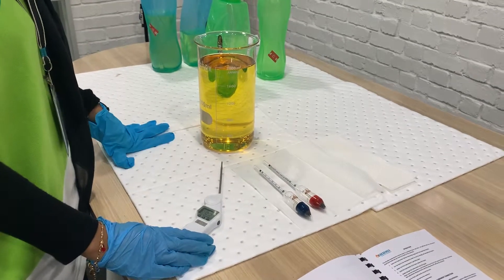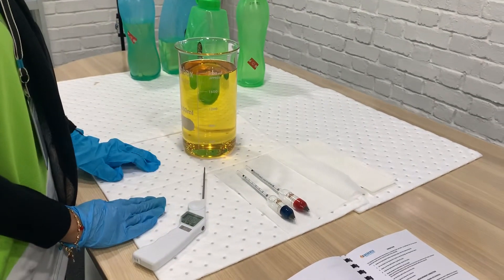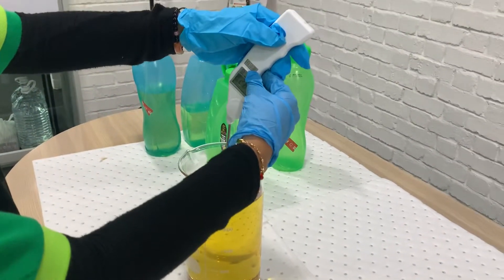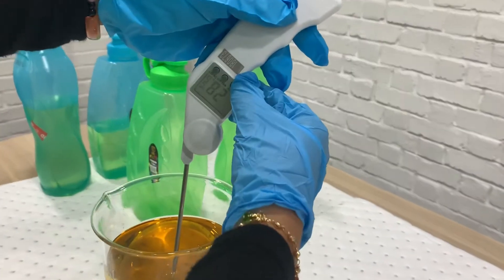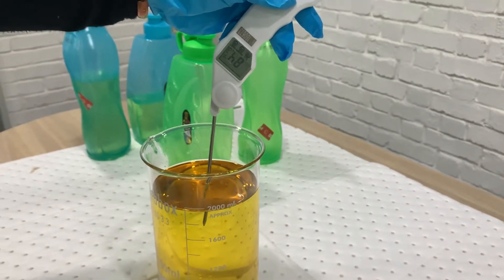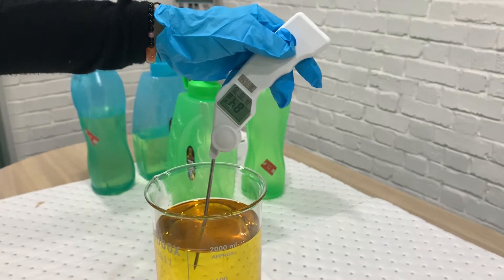Today we want to show you how to measure the density of diesel using a hydrometer. First, we must take the temperature. The temperature is in Celsius and Fahrenheit. The reading is 84.8.